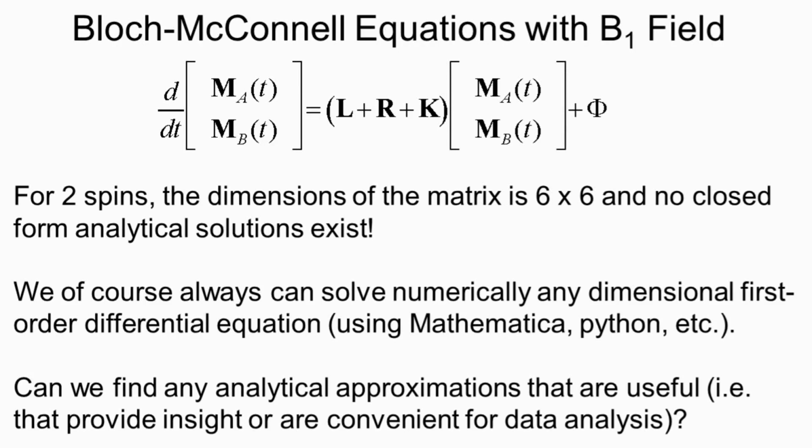Of course, if we have to do a very large number of numerical calculations, that could be very useful for analyzing data, but we may end up with tables and tables of numbers that are very hard to get any insight into about the experiment. So we might wonder if there are any analytical approximations that would either be useful for data analysis or give us some insight into the experiment.